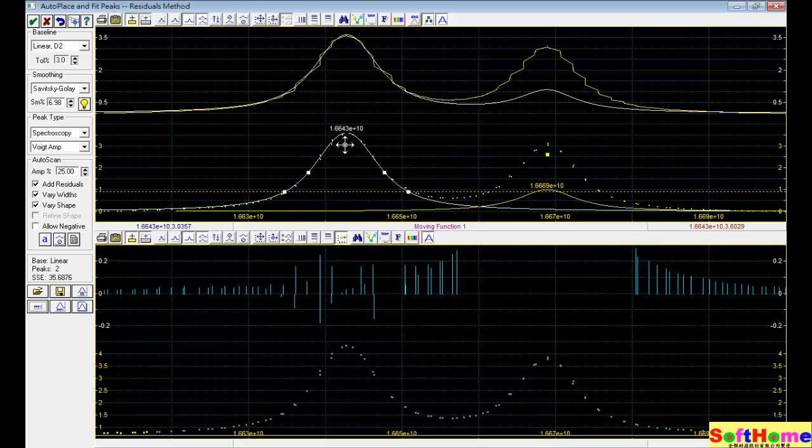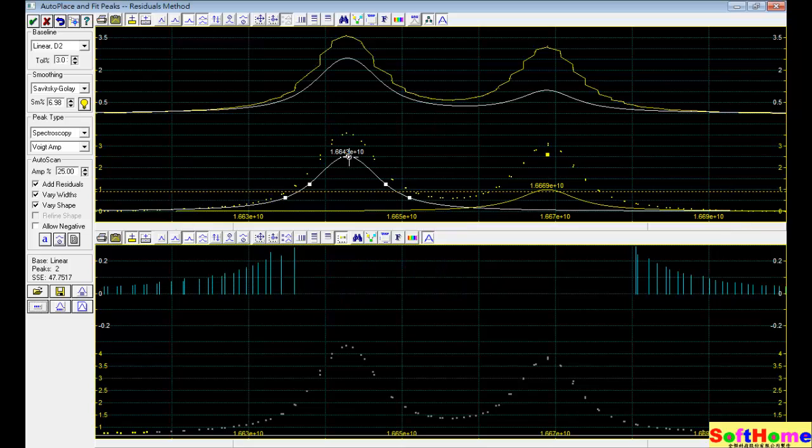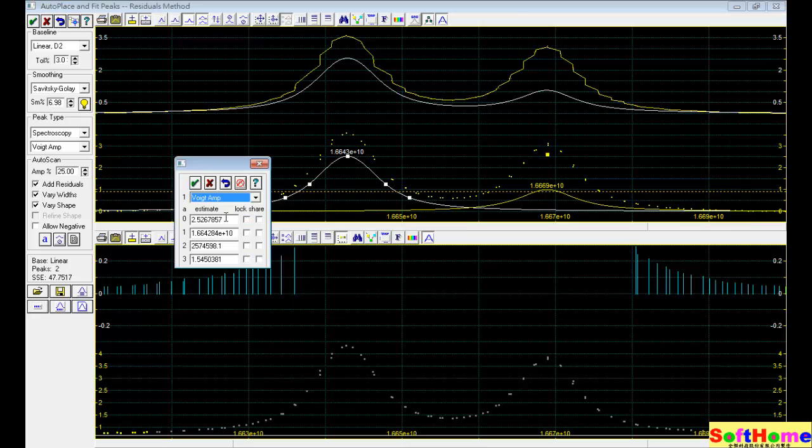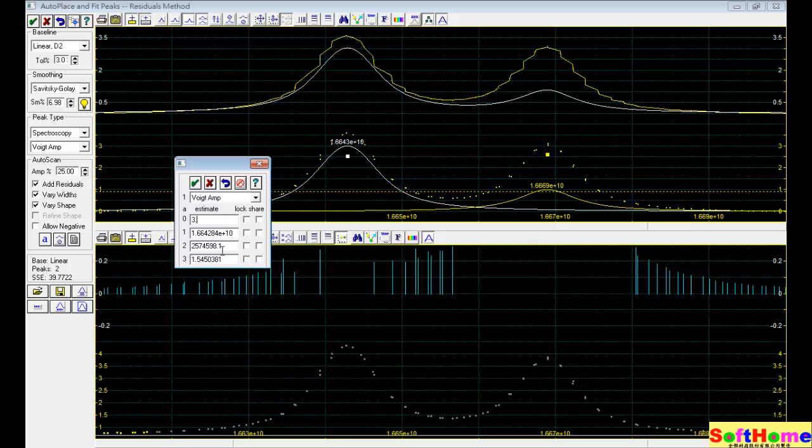And you also can modify the other. So you can change the peak. Maybe you can change the parameter, maybe into 3. Now become higher.